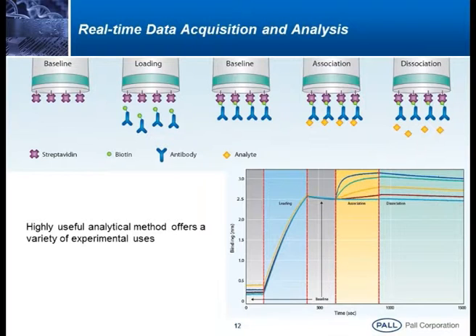When I dip the sensor into the corresponding biotinylated antibody, you see the gradual rise. The same sensor, when I bring it back to the buffer, unbound material gets washed off. Now I dip the sensor into the corresponding antigen for association, and we see curves like this, different dilutions, 2-fold or 3-fold, however you are making them. This is the interaction between this antibody and the antigen. Once again I bring the sensor back to the buffer, and we see the dissociation. So this is what we completely call kinetics.